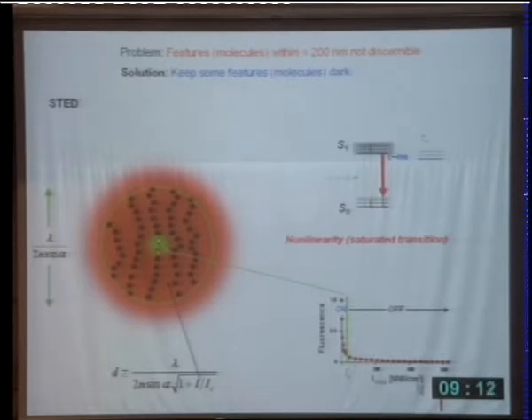So one way of thinking about this, and if you have an optics background, you may be prone to thinking that way, is to think, okay, this is non-linearity, what's going on here, because, say, having a threshold and shifting the threshold to the center is, if you will, a saturated transition that is taken advantage of in this particular case. I agree with that. But a word of warning, non-linearity is not the best line of thinking for very fundamental reasons.